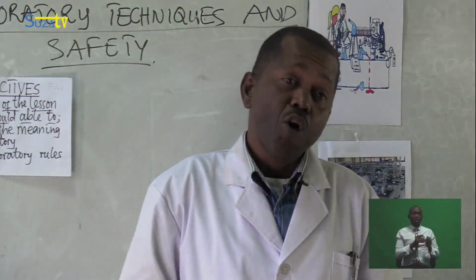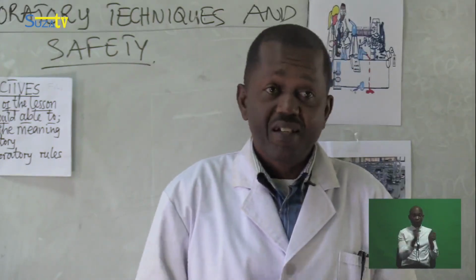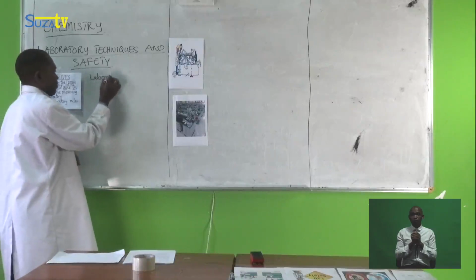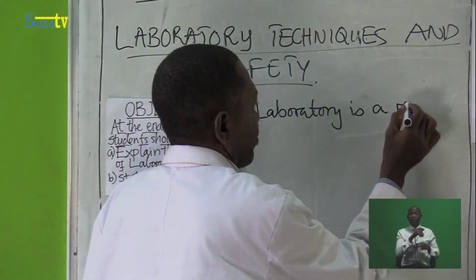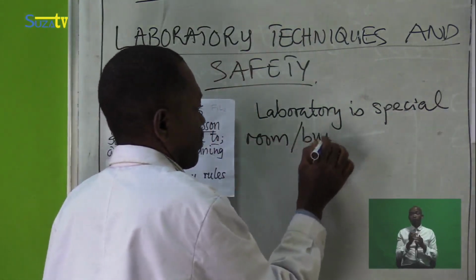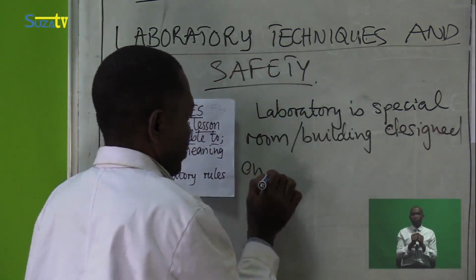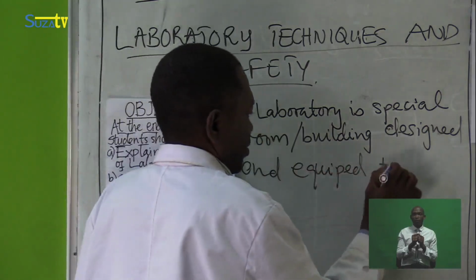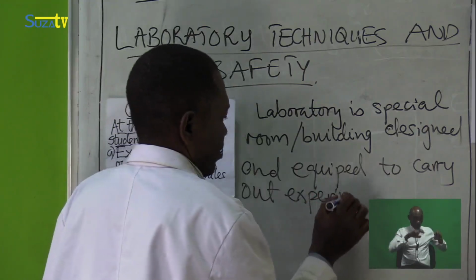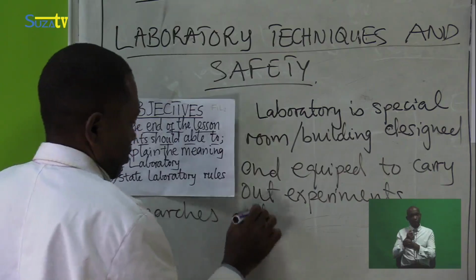A laboratory is a room or building designed and equipped for carrying out experiments, research, and also for teaching.